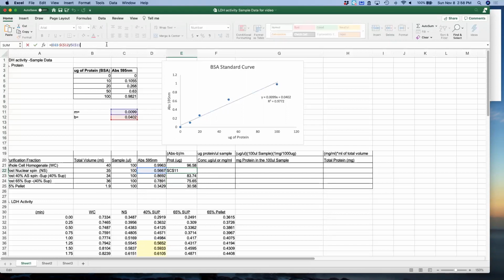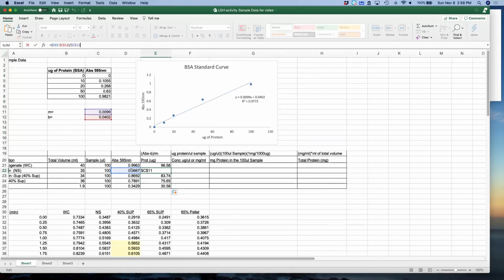It propagates your formula. But do you see how here it moved the blue box, the absorbance box, down to the next one because I didn't put any $ signs, but the red and the purple stay the same because they each had $ signs in front of both the letter and the number. So that's really, really, really important, right?